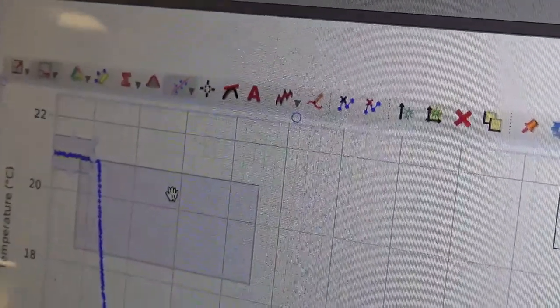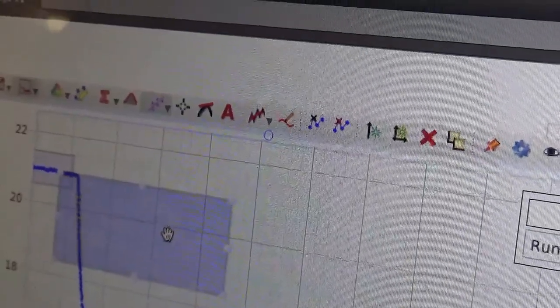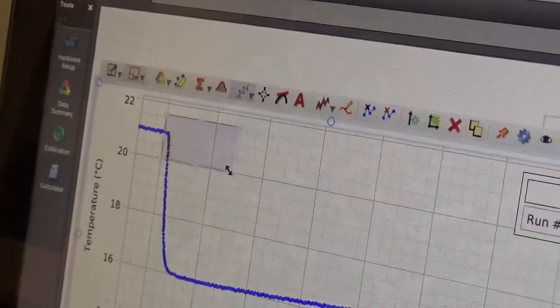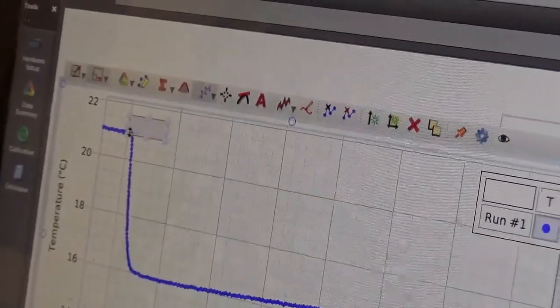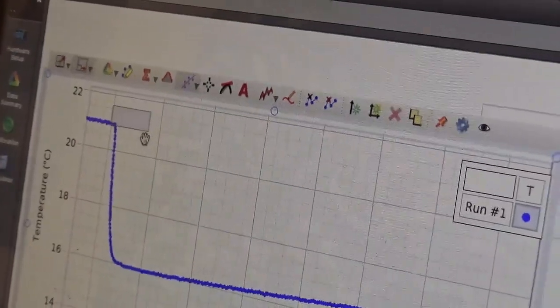So I think that box, wait a minute, I've got 2 boxes, I gotta get rid of this one. Oh, I gotta shut it off. And then I'm gonna hold it over, if I can move it. Uh-oh, what happened?